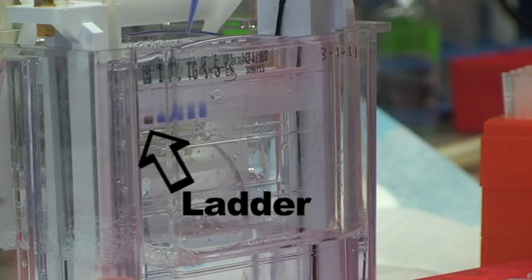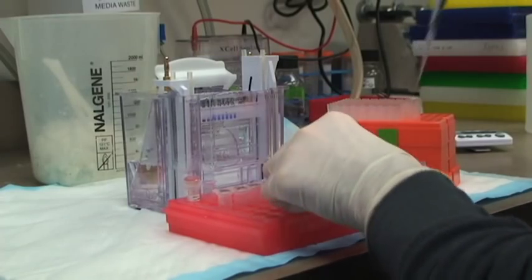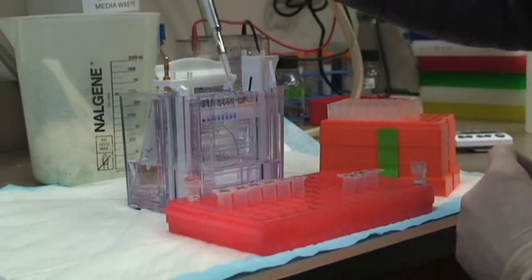The first sample is a mixture of proteins of known sizes. We call this a ladder, and you can use that to compare your samples so you can see how big the different proteins are.